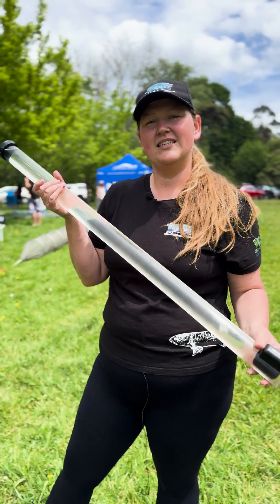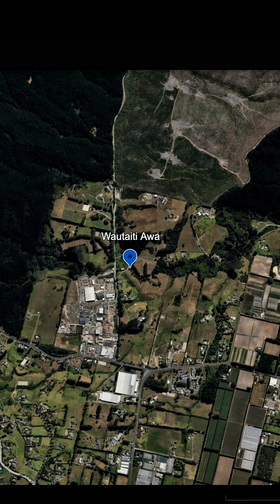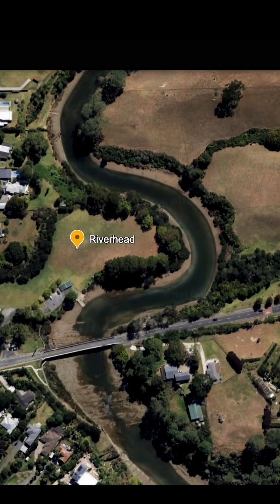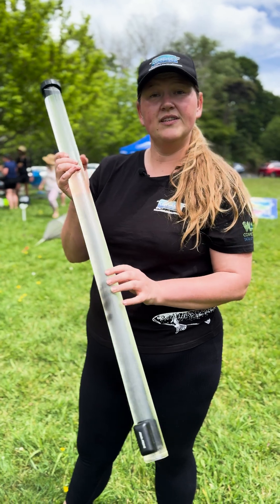I sampled this from the Wautaiti Awa, which is a side tributary that runs into the Rangatapuni River in Riverheads. This clarity tube has a measuring scale on it from 0 to 100 centimetres.